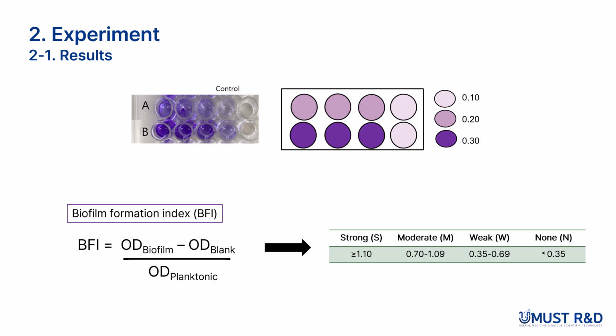To summarize, biofilms are protective communities formed by bacteria. They help bacteria survive harsh conditions and resist treatment. We learned how biofilms form and how we can measure them today.